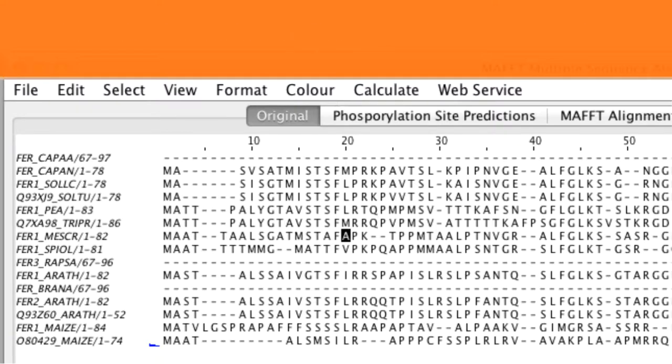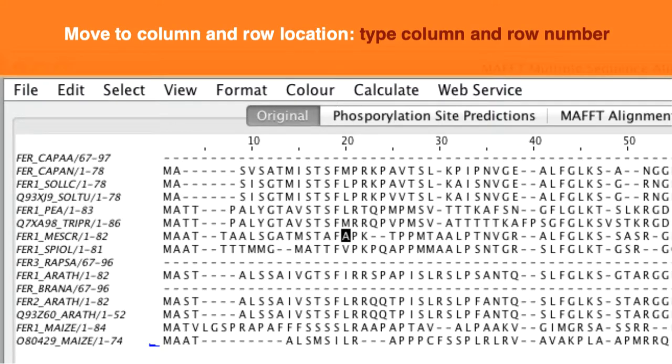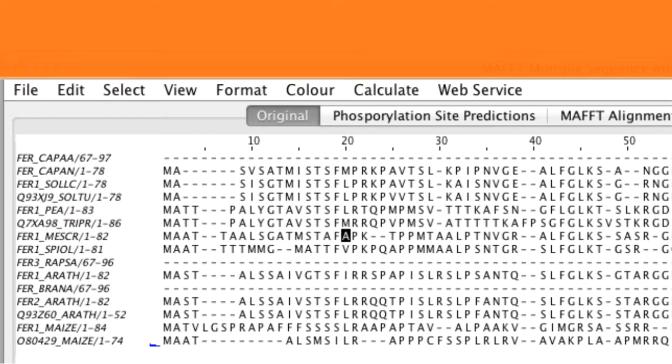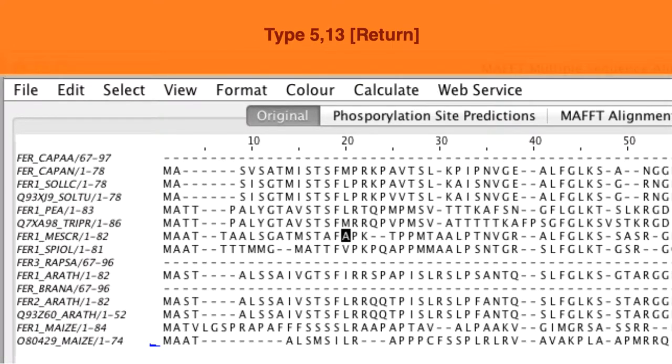To move to a specific row and column location. For example to move to column 5 sequence 13 you type 5, 13.